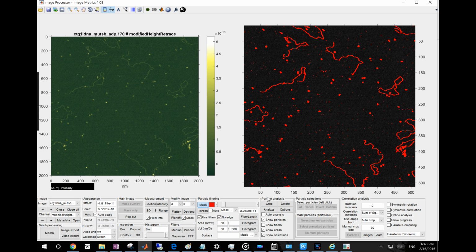So one thing you can do, well, at this stage, you can go ahead and click the Analyze button, but you might want to use the threshold button. It's not really anything substantial, but it gives you a preview of the results, like what's included and what's excluded. Otherwise, if you click the Analyze button, it's analyzed. You will know the results, but it does not give you a preview. That will be some kind of final result. If you want to go back, you have to delete the analysis and redo this procedure again. So the threshold function is really a preview.